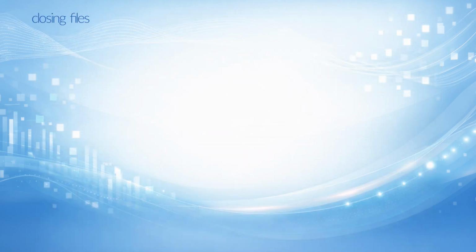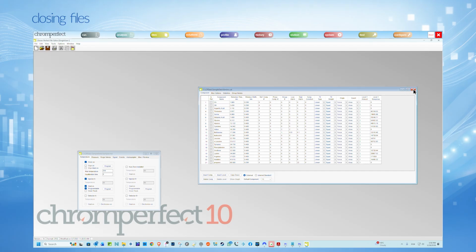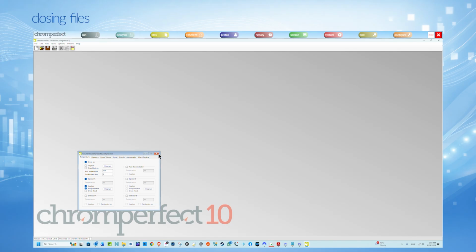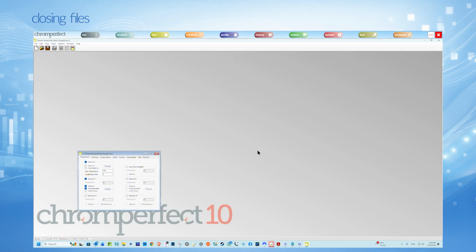Closing files. To close the active editing form, choose File, Close, or click the form's Close box. If changes have been made since the last save, you will be prompted. Choosing Yes saves the file and closes the form. Choosing No closes the form without saving, and changes are lost. Choosing Cancel leaves the form open and unchanged.